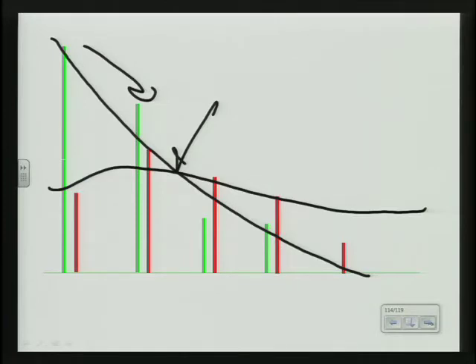And so you start seeing, if you've got this degraded, the major component, which is degraded, is following this ski slope type of thing. The minor component, which isn't degraded, is staying somewhat close to straight across. And the problem comes in during your interpretation: you're not going to know. I mean, obviously I knew what the components were going into this, but when you're looking at the actual profile, you don't know when they cross. And so you start getting into this kind of gray area of how far out are you going to go down the ski slope where you're still confident that the major component is the major component at that. Yes, Steve? Please.